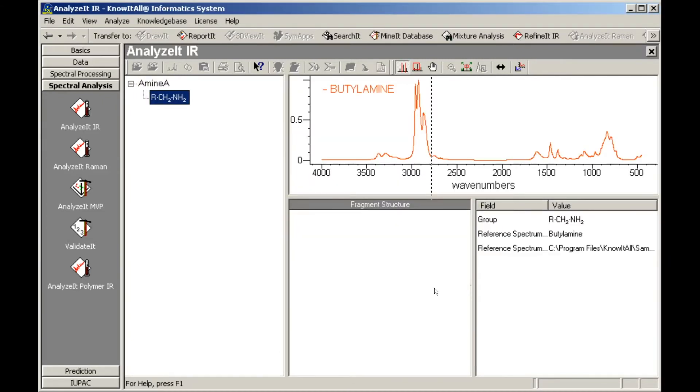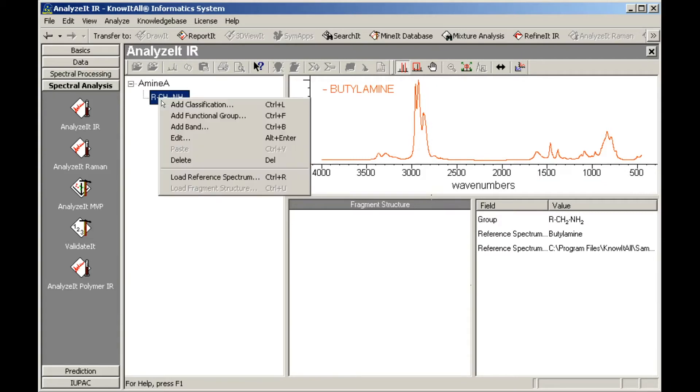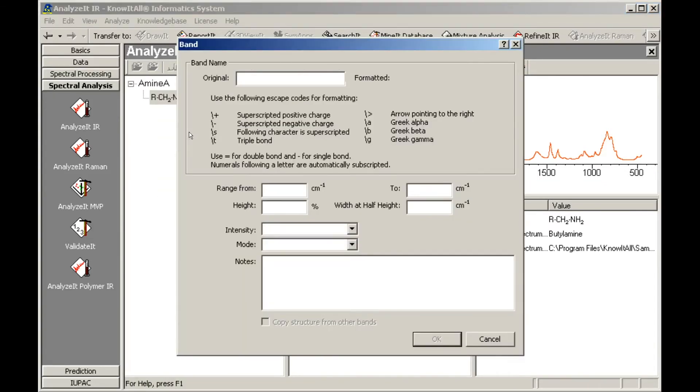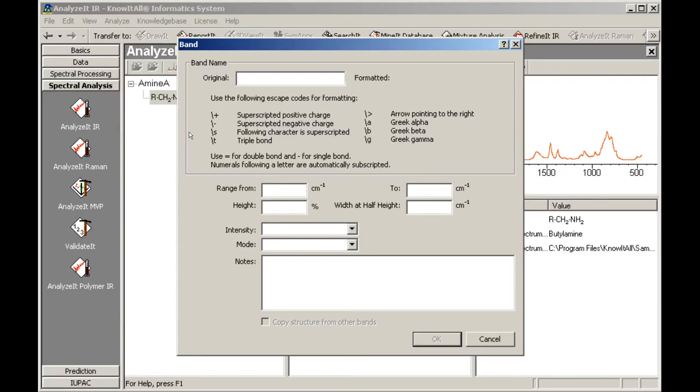Next, select the functional group, right-click, and choose Add Band. The Band dialog box opens. First, type the bond in the text box. While numbers are automatically subscripted, other special formatting—superscripts, triple bonds, arrows, and Greek letters—can be added using the displayed codes.